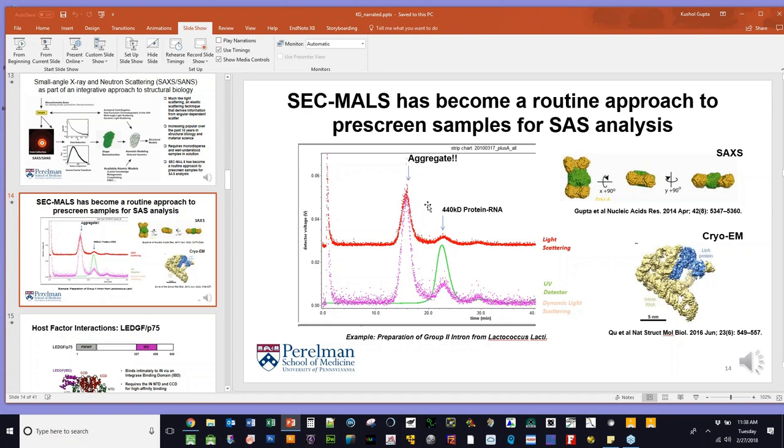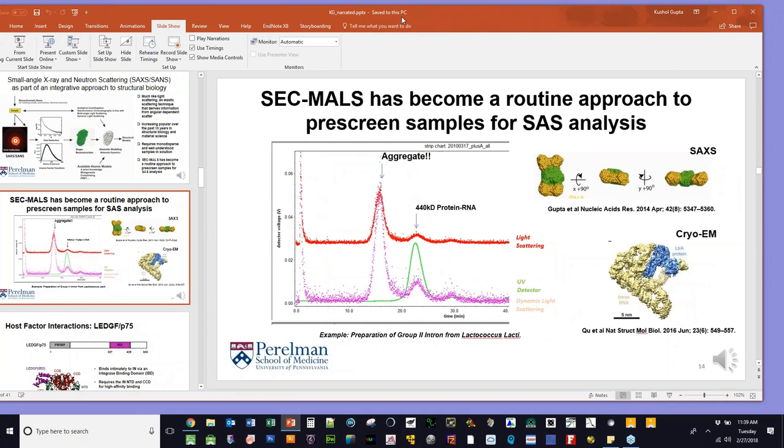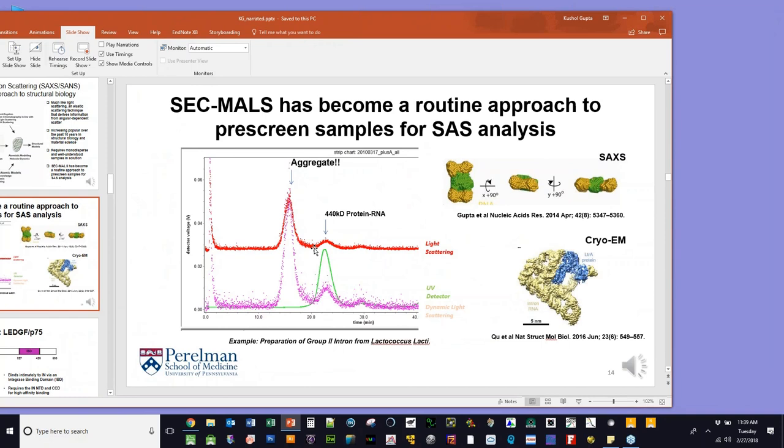Oh, thanks for that question. First, thank you again for this opportunity to speak to you all and talk about my work and how important light scattering has been. With regards to why we can see this aggregation and we can't see it with UV, many biopolymers don't have optical activity, first off. Even though proteins naturally usually do, even with tryptophans and tyrosines, you may not see aggregation, because light scattering is a wonderfully sensitive technique in the way that X-ray and neutron scattering are sensitive. The intensity of scattering in these elastic scattering phenomena generally varies with the square of molecular volume. So even small amounts of these higher order species can contaminate the overall intensity of the signal.